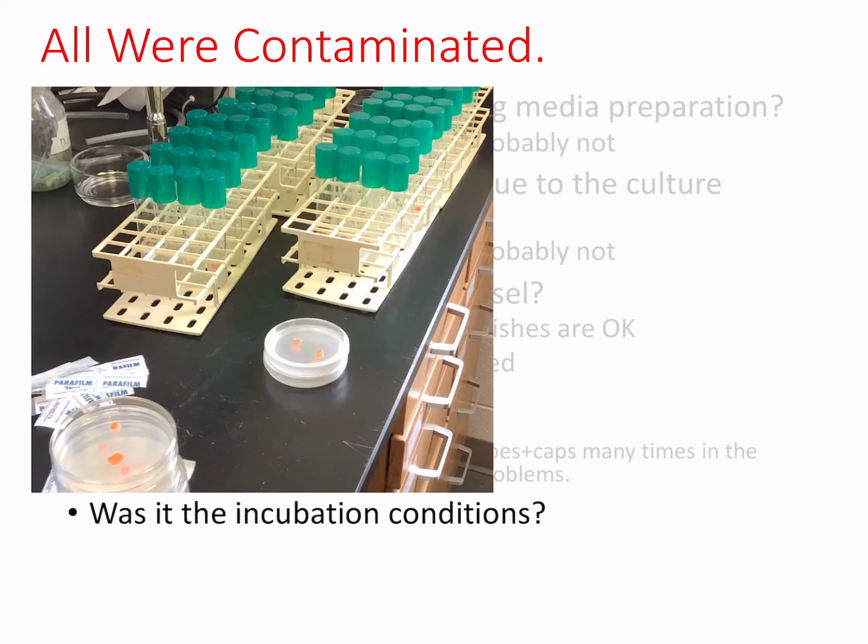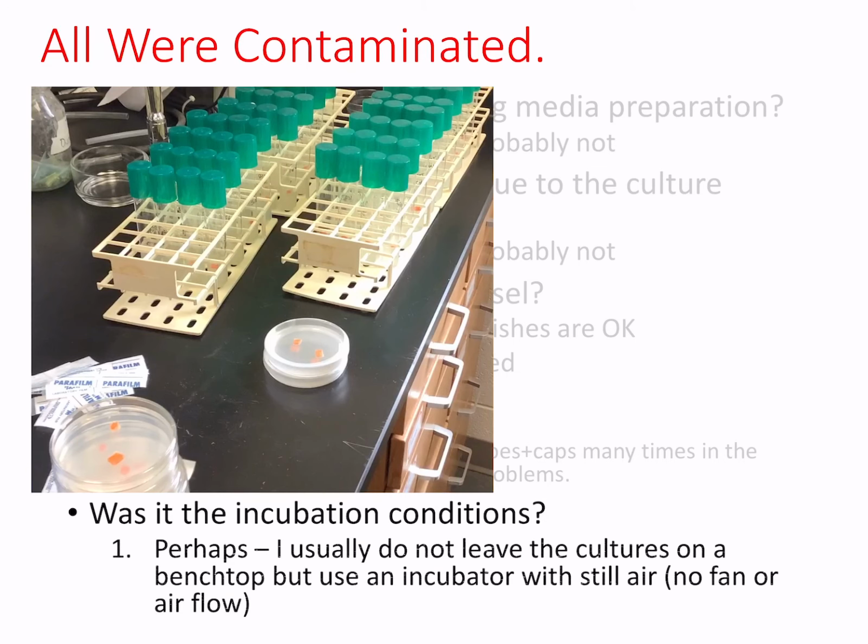We can also question the incubation conditions. In this case, I left everything out on a bench. That's what the protocol suggested, just to leave everything out on a bench. And if we were doing this in a class setting, the students would have just left it out on a bench out of the way in the back of the lab. So I was trying to recreate that. Perhaps it was that. Usually, if I'm doing a tissue culture experiment, I have an incubator where the air is still, with no fan or significant airflow. It's just a place that holds a constant temperature.